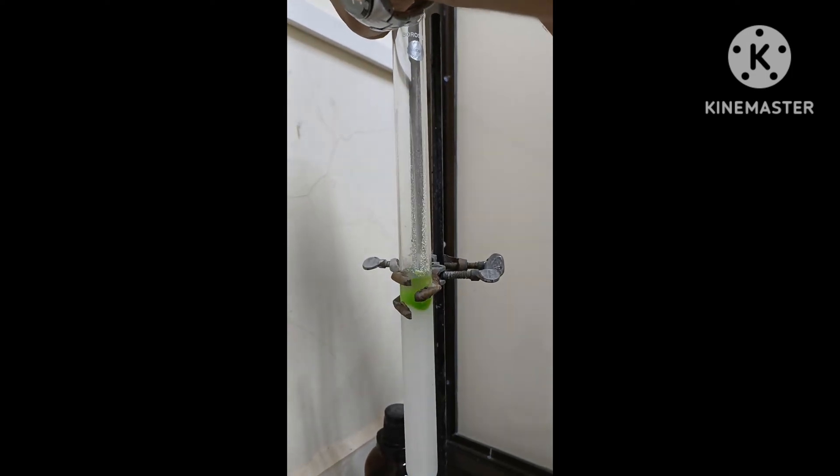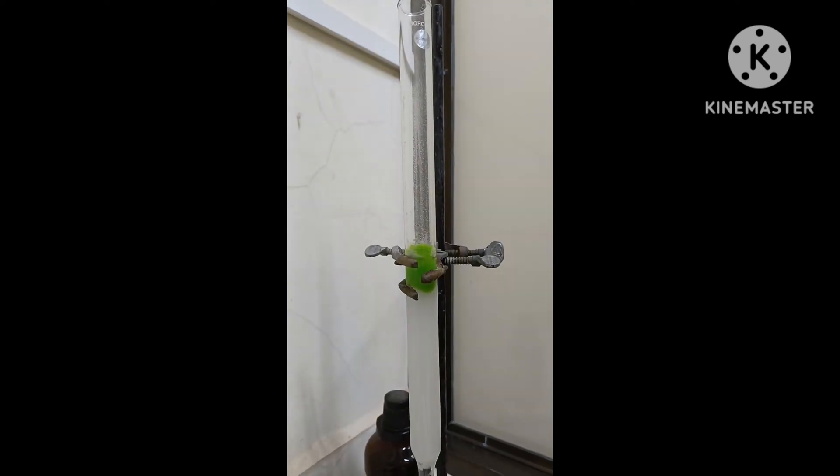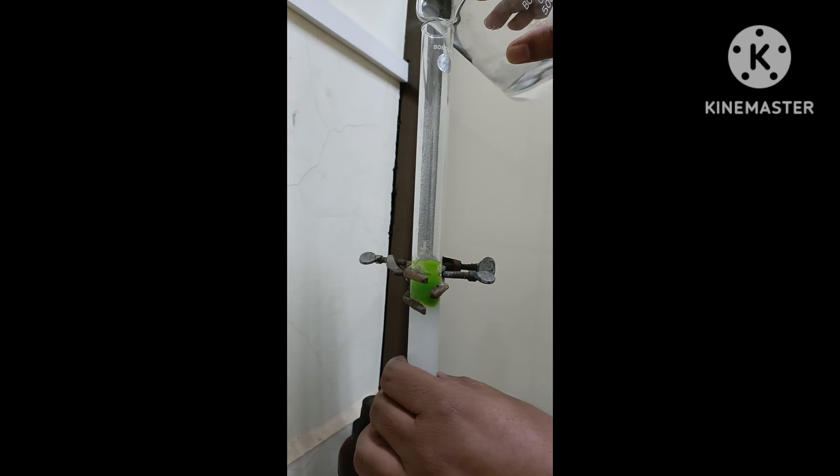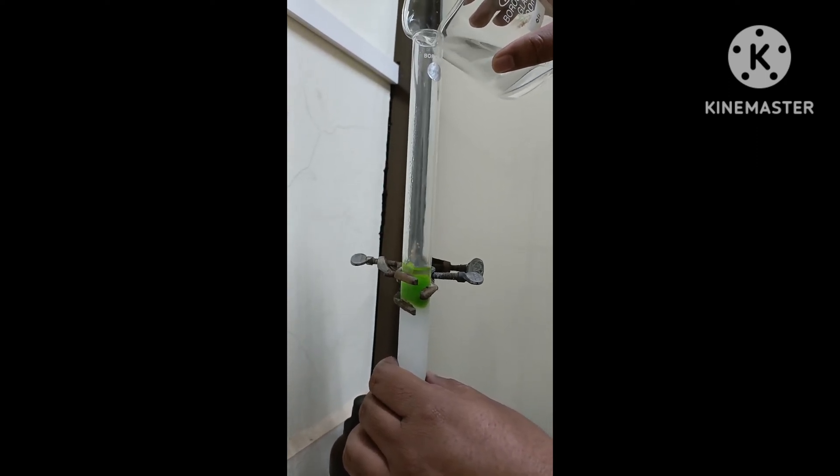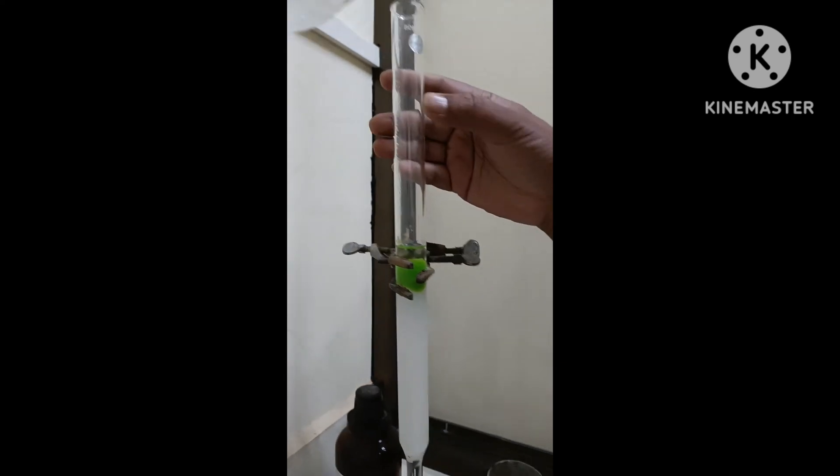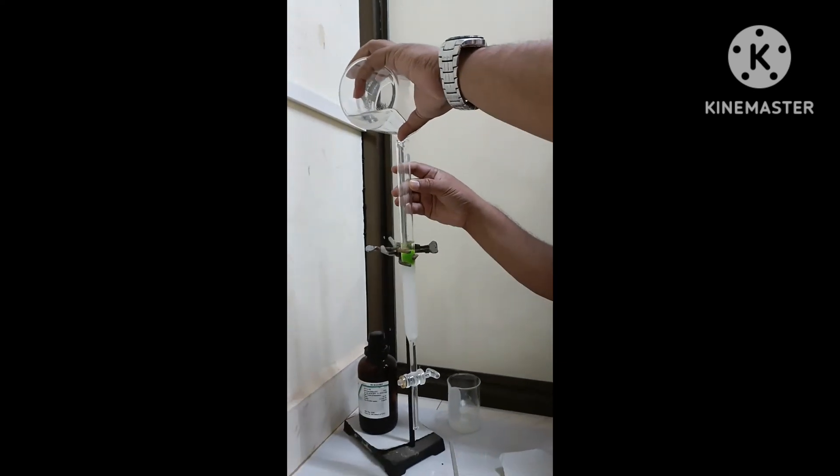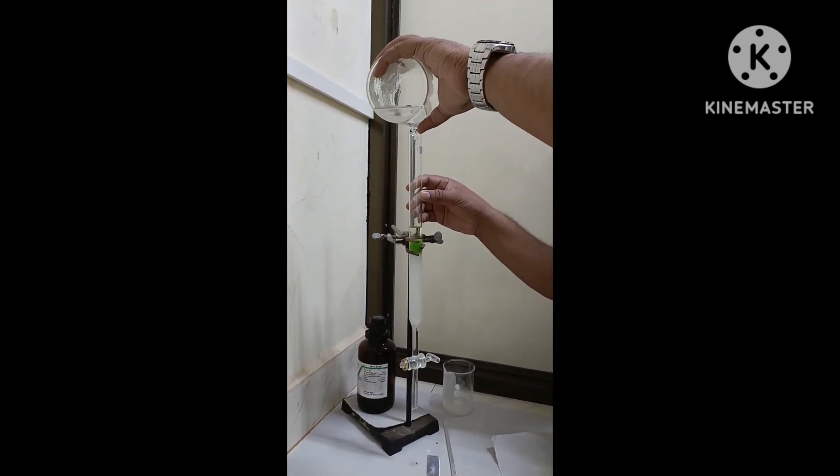This adsorbed sample, we are going to load in the packed column. Because we have adsorbed, you can see it is going smoothly and not disturbing the column packing. Very gently, we have to add the solvent that is n-hexane here.